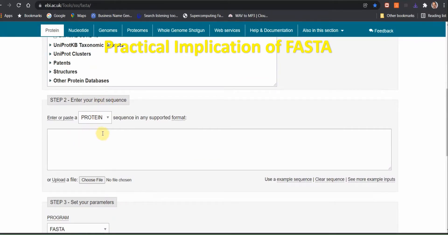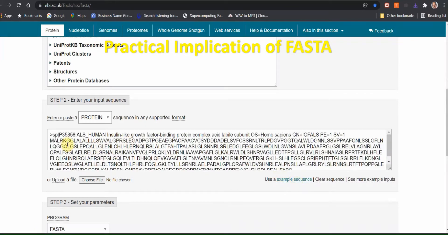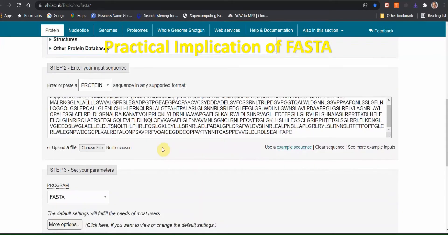In step number 2, they are asking to enter your input sequence. The input sequence is better in the FASTA format. FASTA format means starting with a greater than sign. I am not going to input new data; I will take an example just to show how the procedure will go forward. Here is the example sequence — click here. An example sequence has appeared, and it begins with a greater than sign, indicating that the sequence is in FASTA format. This is actually human insulin-like growth factor binding protein complex.